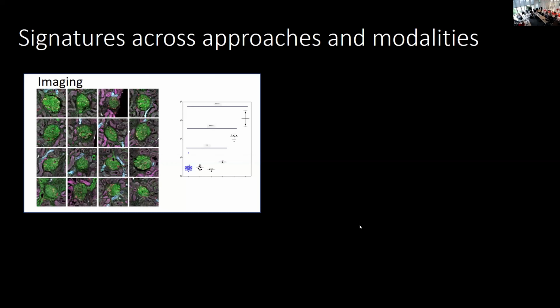17. Okay. So importantly, I just had a question from the room here about where the program operates, and it was developed as a plugin for Fiji, and everything you just saw wasn't done on some sort of supercomputer, it's done on a MacBook from 2-3 years ago. So in terms of the heaviness of it, it's a pretty lightweight program and fairly effective in its use.